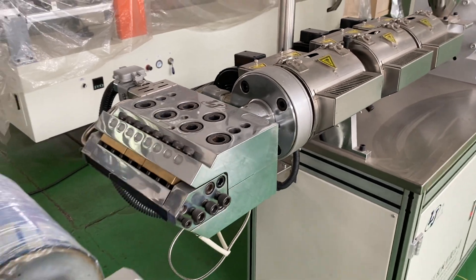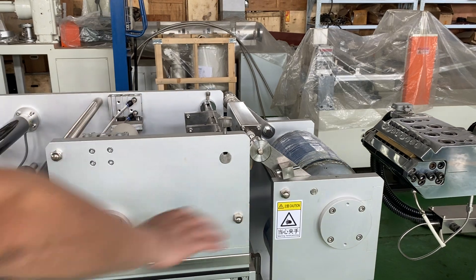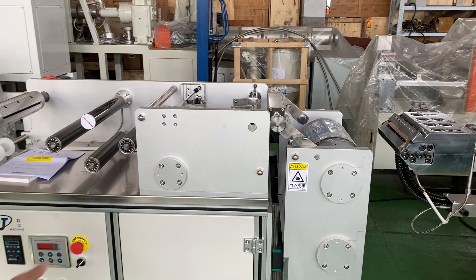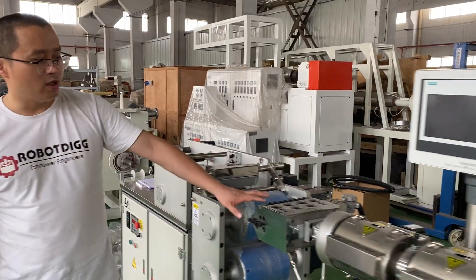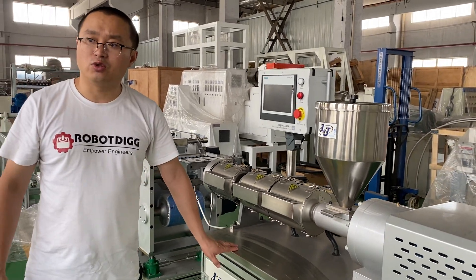This is the winding and tractor unit. There are two parts: this part is the winding and tractor part, and this one is the extruder.